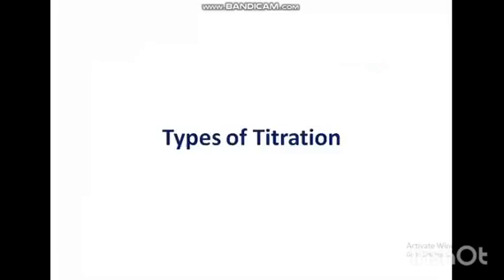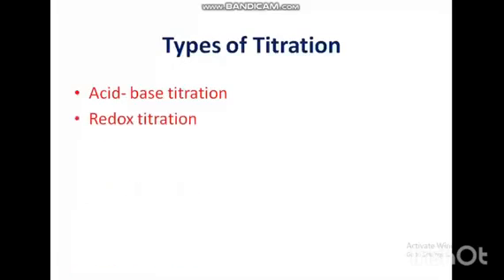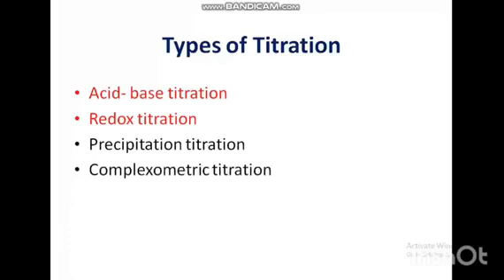Types of titration. We have acid-base titration, redox titration, precipitation titration, and complexometric titration. All these types of titration involve same technique, which we shall learn in this training. SSCE focuses on acid-base titration and redox titration only.